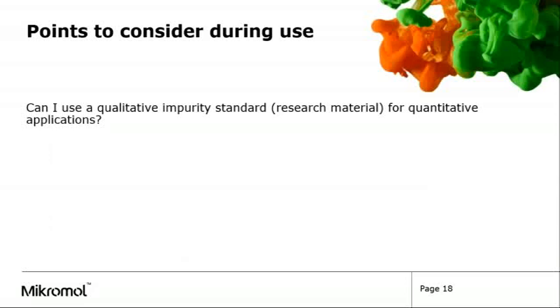One point that comes up often is, can I use a qualitative impurity standard, such as obtained in the research lab, for quantitative applications? And we'll see that the answer is yes, that's possible, but you need to be thinking about your intended use.